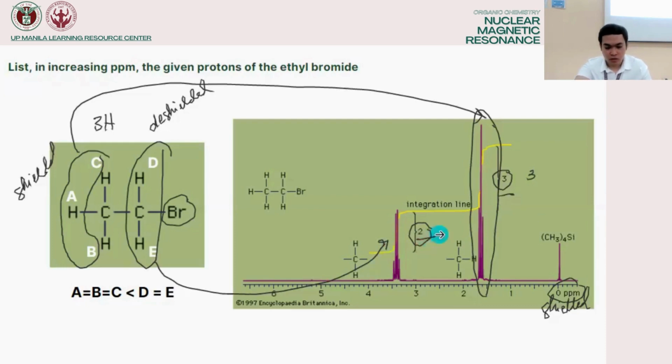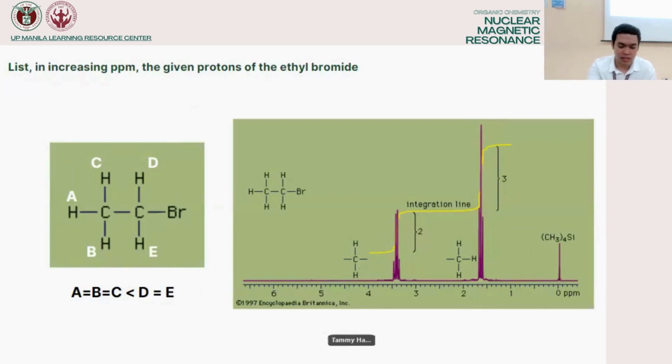Okay? So, ang sagot ni Jay, increasing tayo ha, hindi tayo decreasing ppm. Ang increasing ppm natin pa left. So, do not be confused with that. So, from right to left is the increasing delta or ppm. Okay? Sige, clear natin.